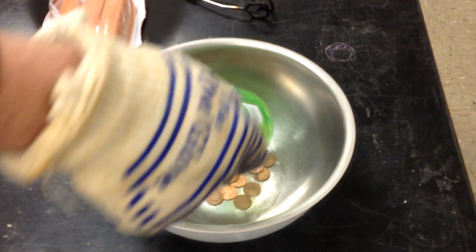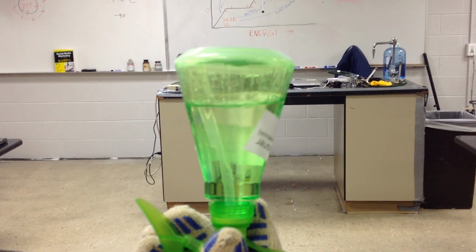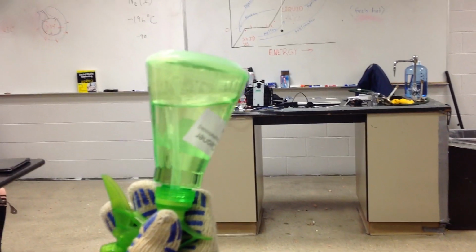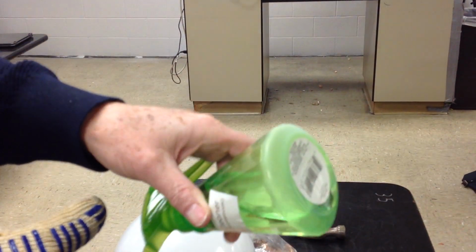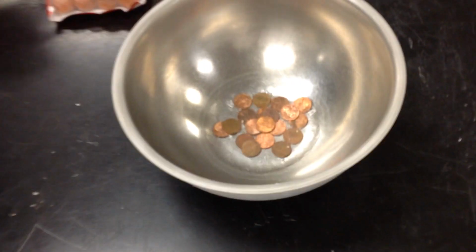All right, let's see what happens. All right, there's some frozen alcohol in the bottom, and that went fast. That was a lot. Whereas water went slow. Okay? See the frozen part in there. All right. Now, need some more nitrogen.